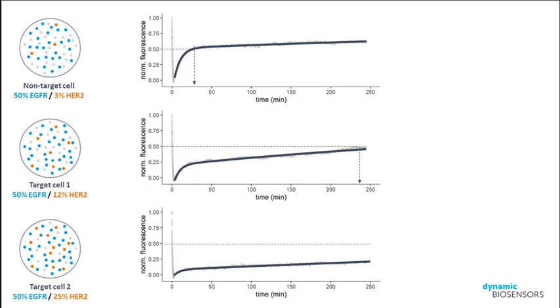In this case, one important consideration in the development of therapeutics is dosing. Dosing and the affinity for target versus non-target cells are both interconnected features. If you're only engaging your antibody rather weakly, it means that at very low concentrations or very low doses, you also minimize non-target cell binding and really only select for the target cells that you're interested in working with.